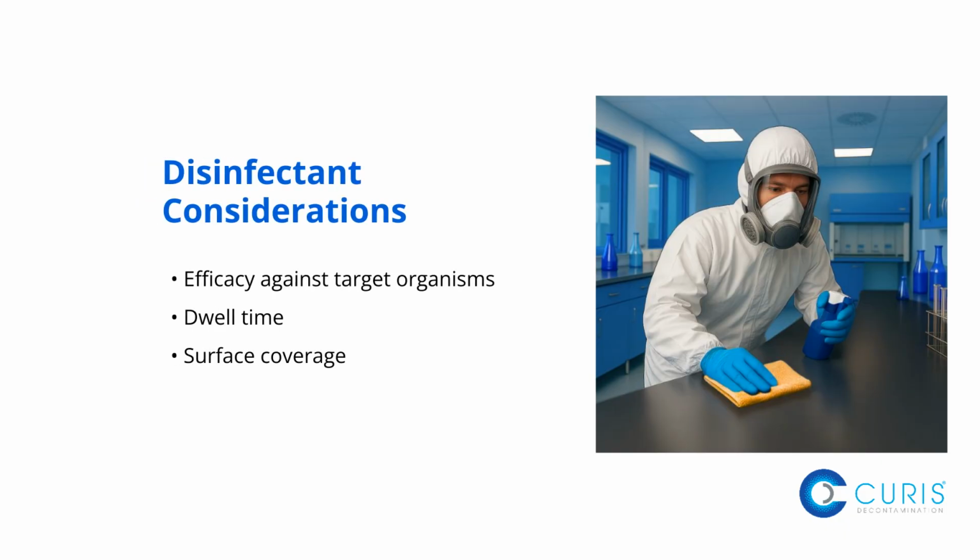Another major issue is dwell time. If a disinfectant is wiped off too soon, it may not have enough time to kill the organism, making the process ineffective. Surface coverage is another weak spot. High-touch areas like door handles, bench tops, shared equipment, and control panels are often overlooked, yet they're common hotspots for contamination.